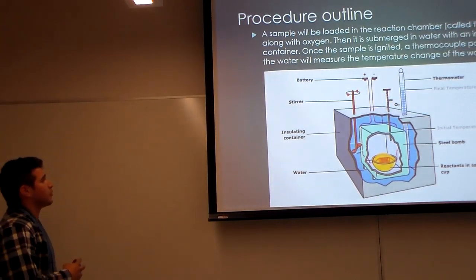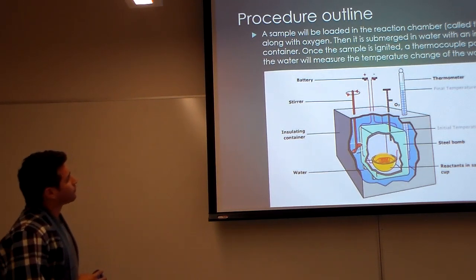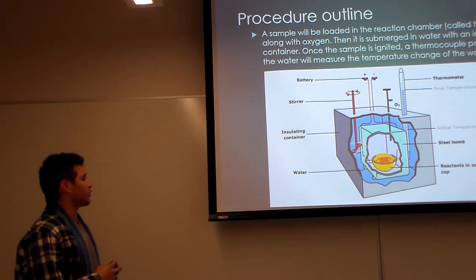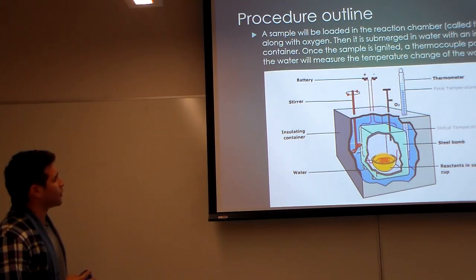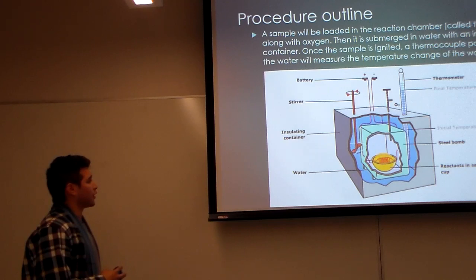Pretty much the sample will be loaded into a reaction chamber that's completely isolated. It is purged with oxygen to remove any of the air inside. Then it will be submerged in water in an insulated container. Once the sample is ignited, a thermocouple will measure the change in water temperature.